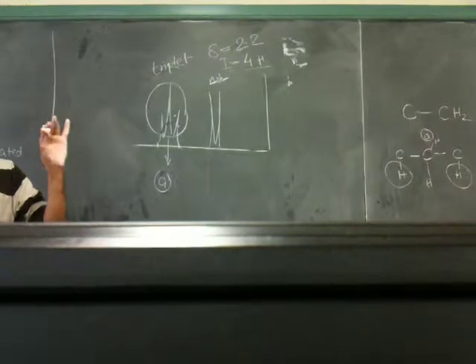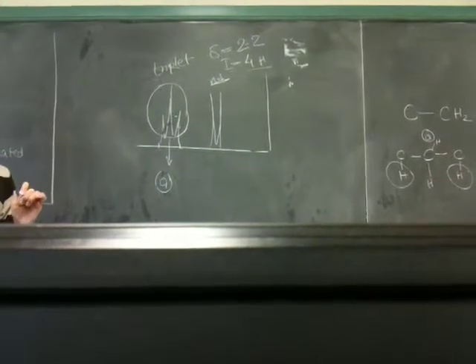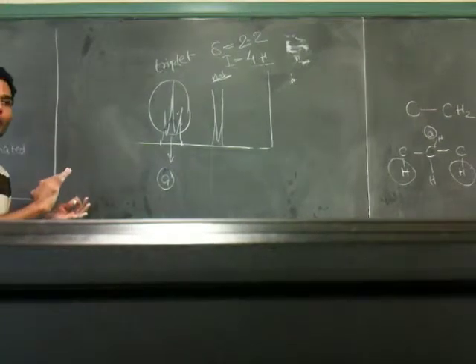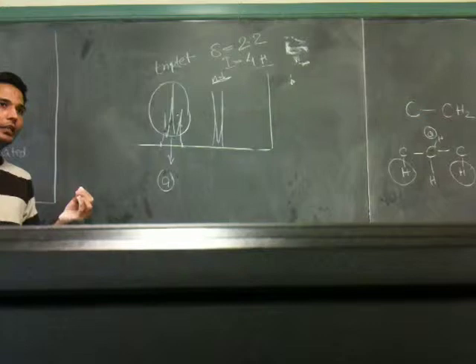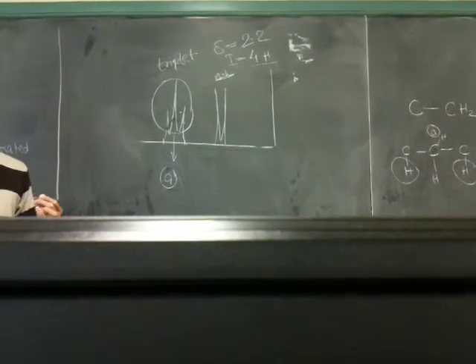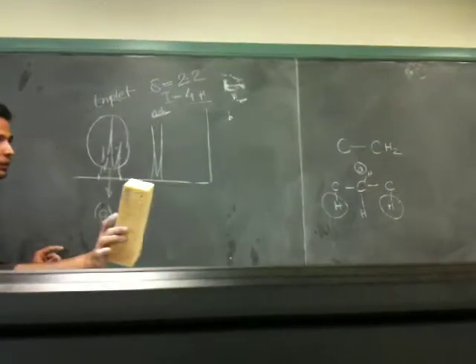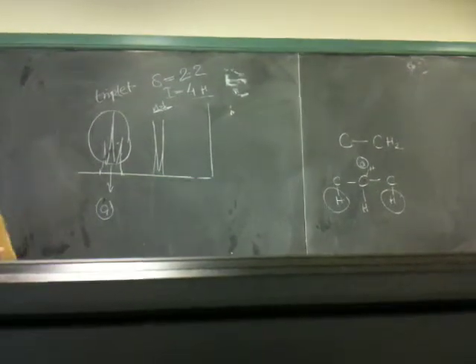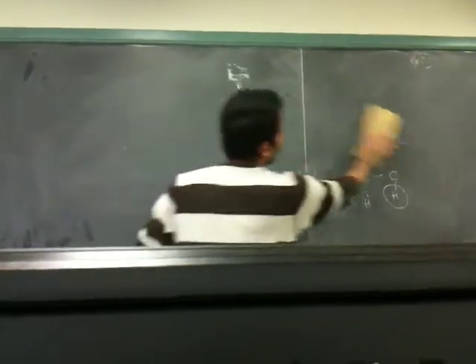I always recommend that once you come to your final structure, look at your question, draw the spectra for that particular structure, and see whether it matches your problem or not. If it does not match your problem, it's not right. Okay? So let me go over some examples, and that will make it more clear to you guys.